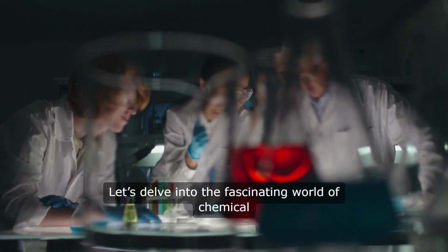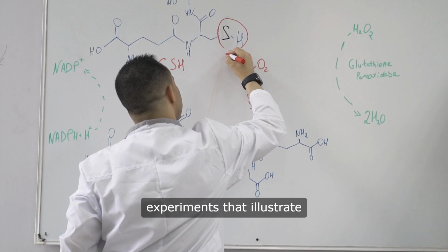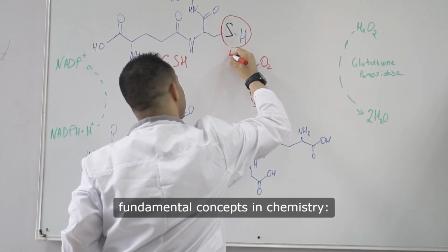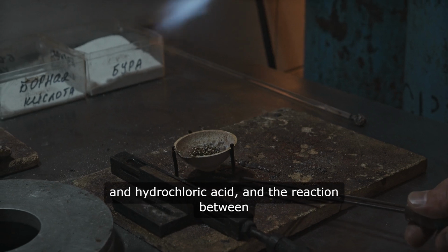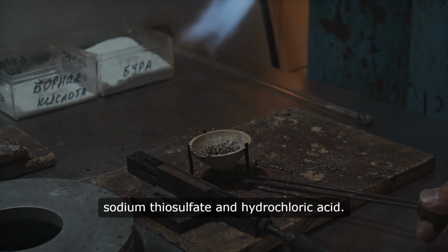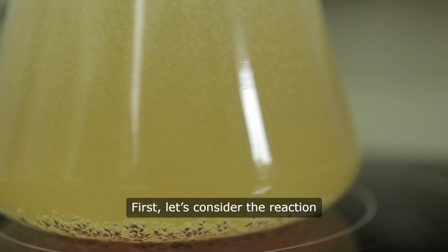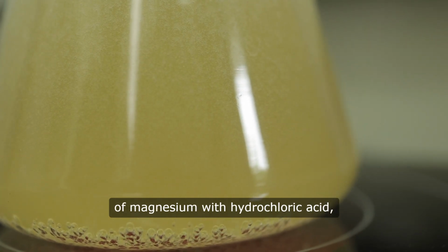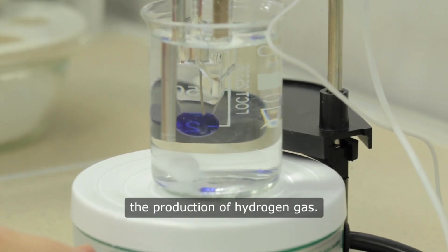Let's delve into the fascinating world of chemical reactions, specifically two intriguing experiments that illustrate fundamental concepts in chemistry: the reaction between magnesium and hydrochloric acid, and the reaction between sodium thiosulfate and hydrochloric acid. First, let's consider the reaction of magnesium with hydrochloric acid, a classic experiment that showcases the production of hydrogen gas.